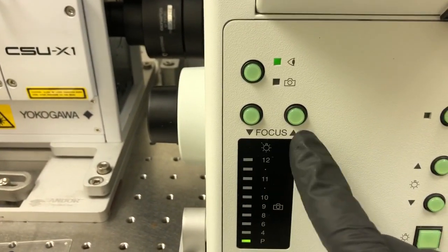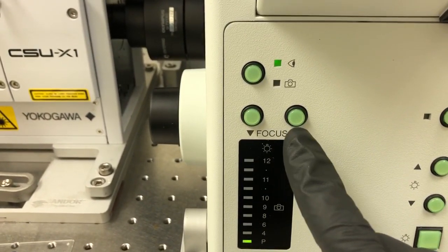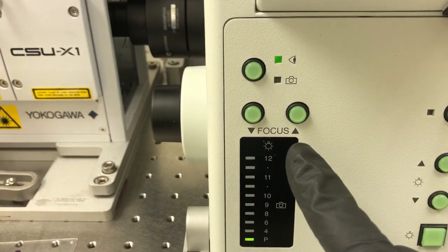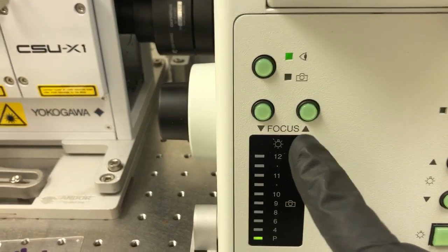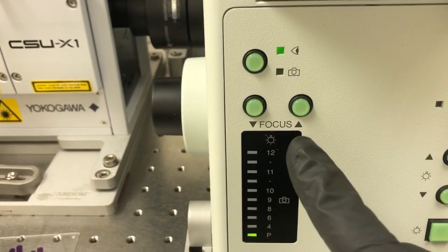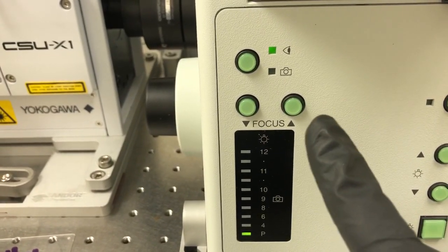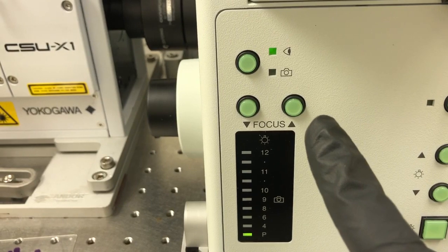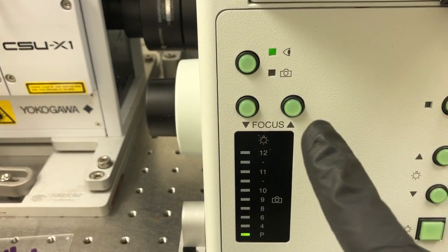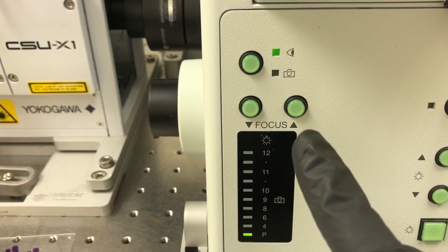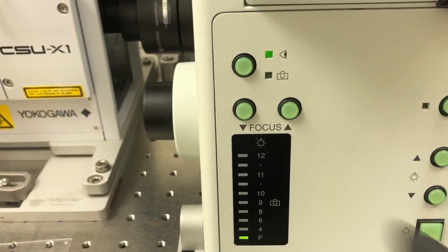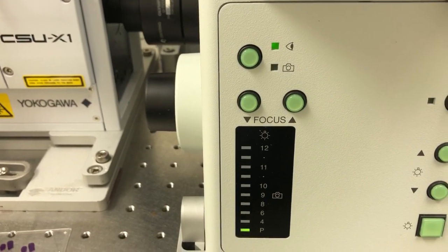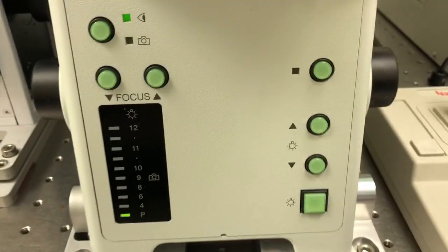These buttons allow you to move the focus up and down quite quickly, so only use them if you know you're very far from the sample. Don't use them if you're using an oil objective because it's very easy to crash into the sample.